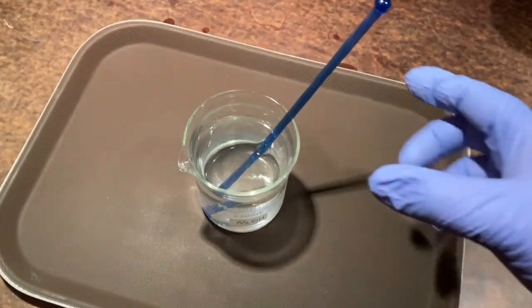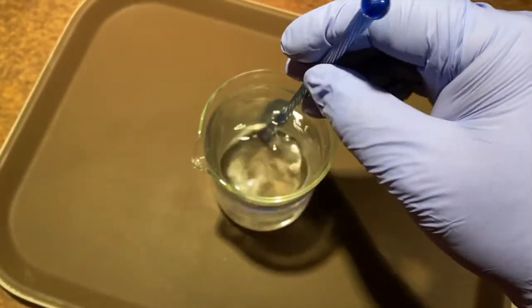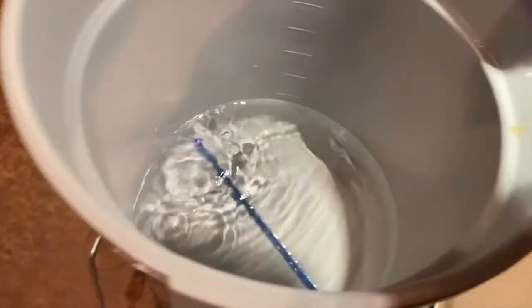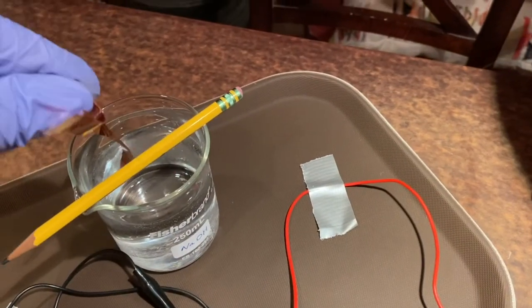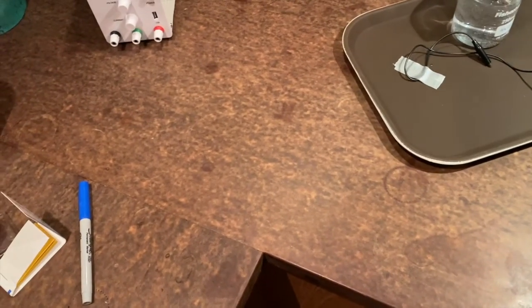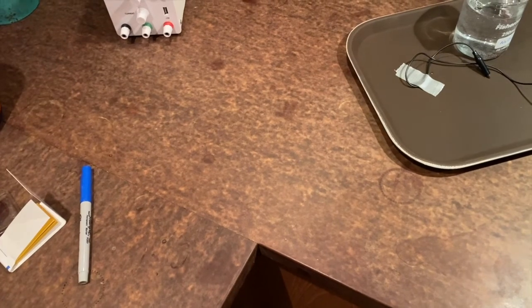Any good hazard plan considers the inevitable cleanup in advance. You and/or your landlord don't want corrosive concentrated bases just being tossed down the drain or put in the trash. The best practice with acids and bases is usually to first neutralize them, in this case by washing items in vinegar. And then, assuming a non-hazardous salt as a byproduct, in this case potassium or sodium acetate, we can safely rinse any items in the sink and dispose of items safely in the regular trash. This includes neutralizing any PPE that may have become contaminated by our solution.